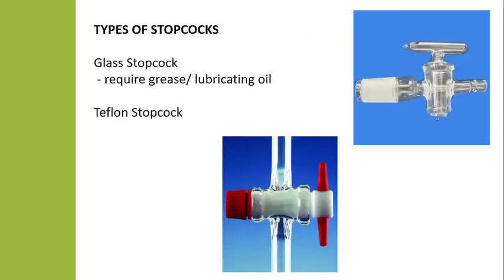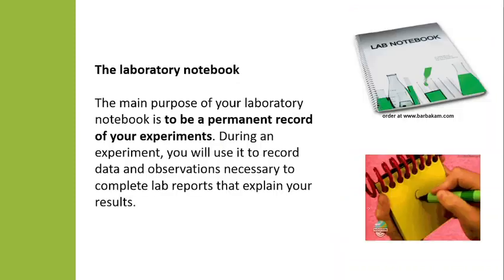Okay? Next are your stopcocks. It has two different types, your glass stopcock and your Teflon stopcock. For glass stopcock, it requires grease or lubricating oil. However, si Teflon hindi naman na. So, it is the one that is widely used, yung Teflon stopcock.